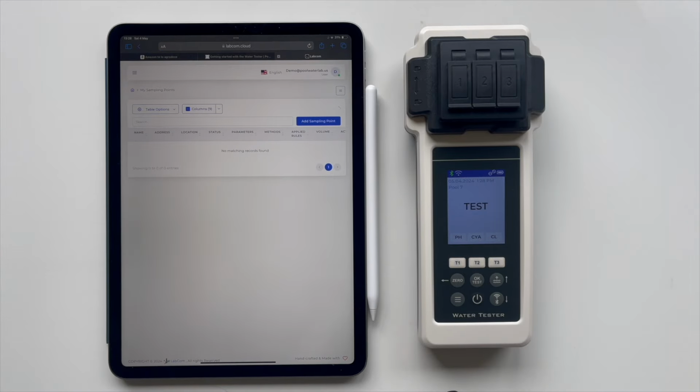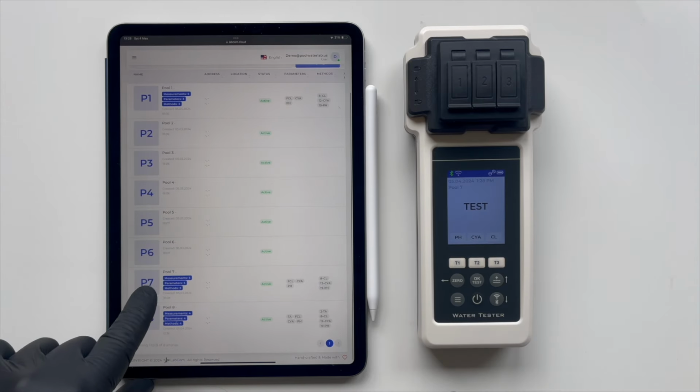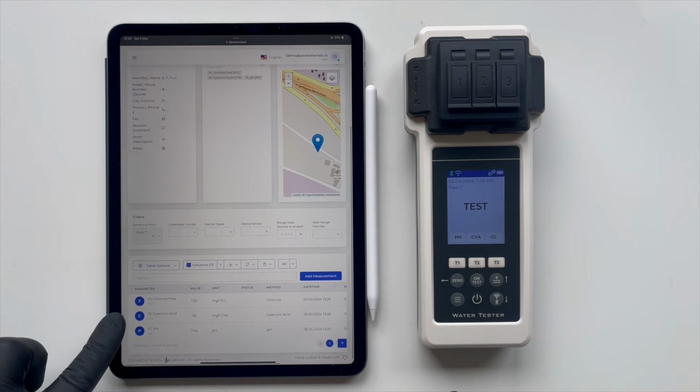We refresh the page on the tablet, and now on the screen, we see Pool 7. All tests for the measurement have now appeared on the cloud interface. This comprehensive display includes all the specific parameters that were tested at the sampling point, providing a detailed view of the water quality at that location.